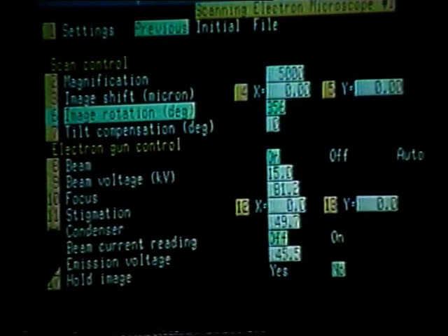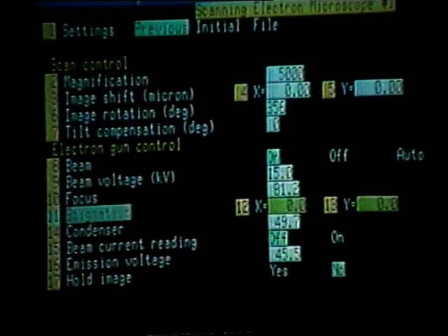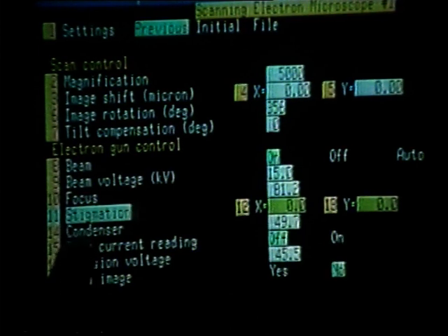by pressing function key number 11, we can now slew both the X and Y stigmators in order to round the beam. Holding the shift key, I can then slew either the left-right arrows or the up-down arrows. Notice I have now slewed through the optimum focus.